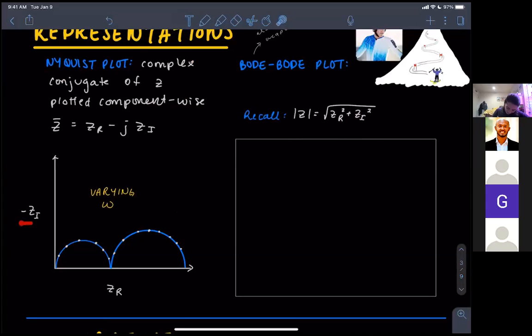And so again, on the y-axis, you have your imaginary impedance. On the x-axis, you have the real impedance. And I'm showing you a random example here. We do very often see these semicircles, and we will get into it in a little bit, why we exactly see those semicircles. There are other shapes that can form. This is just one example.